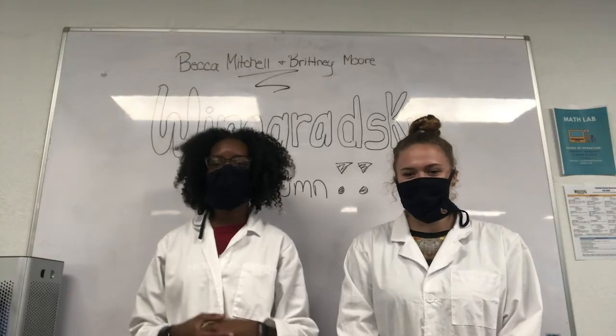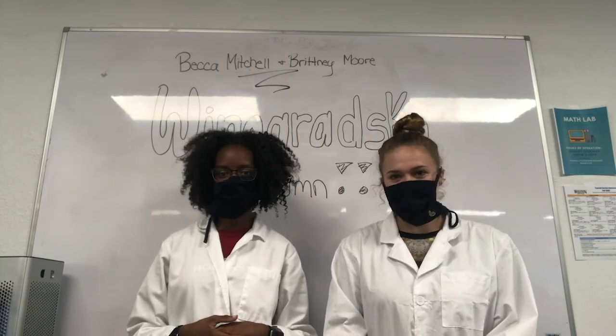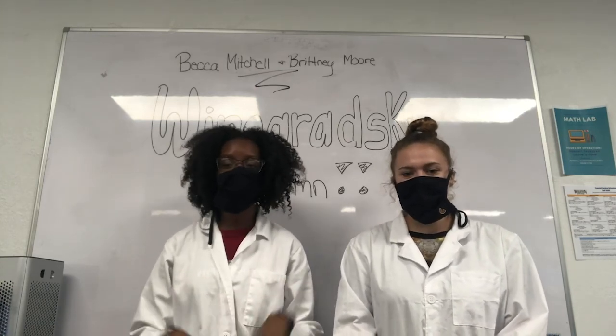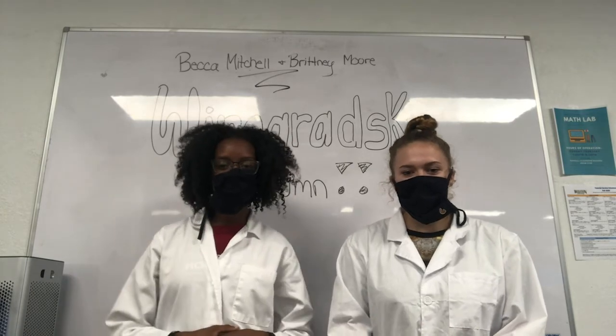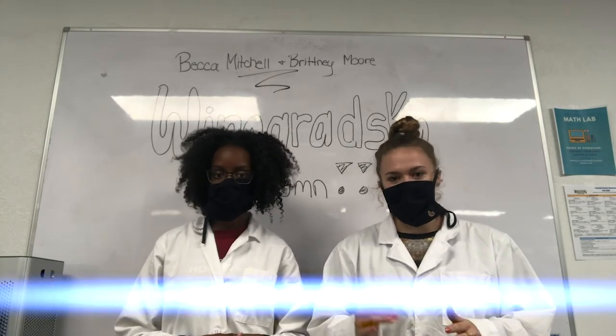And to conclude our video on how to make a Winogradsky column, you should remember to add your nutrient sources, also make sure to have the correct milkshake consistency, and to put it in direct sunlight. After a couple weeks, there should be a defined nutrient layer.